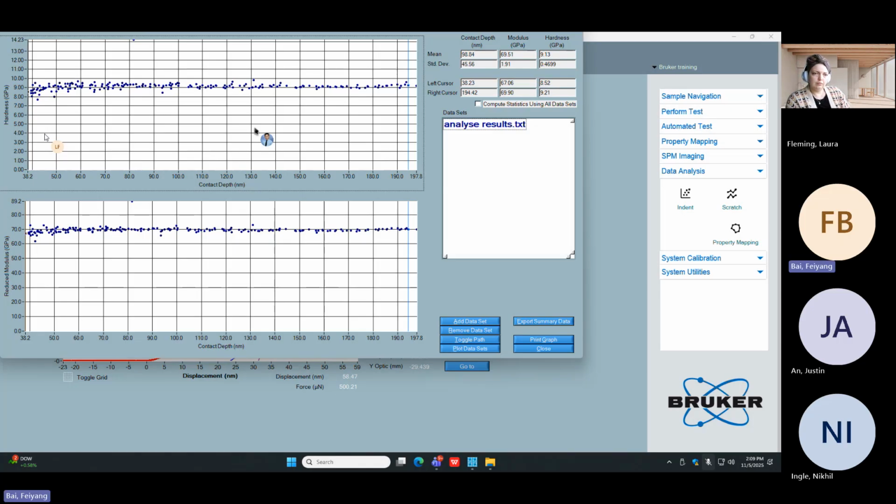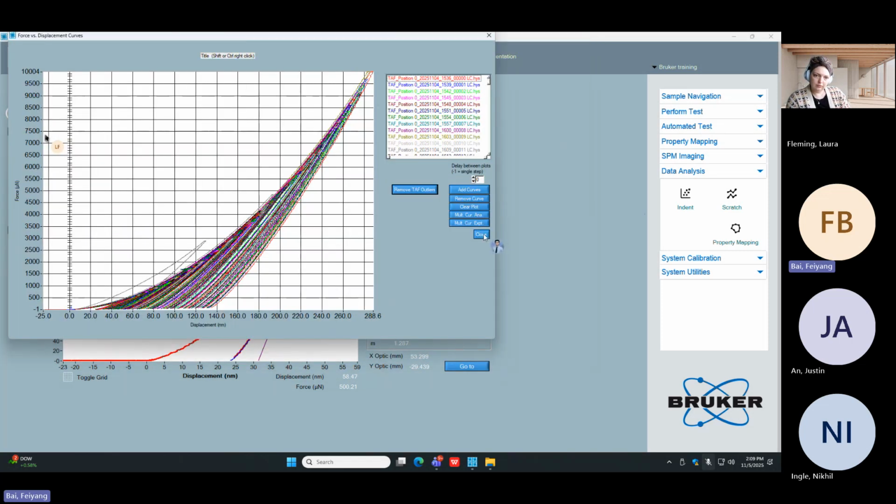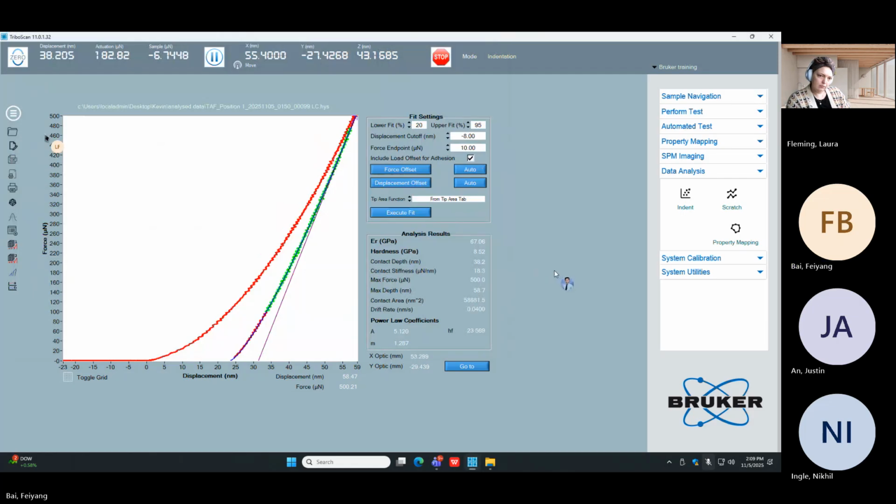Okay, so another question just jumped to my mind. Might sound dumb, but earlier, one before that, after we analyze all the graph, if I click Excel, it still just has the one data, and I cannot add all of them here. Correct. Okay. Good. Yep.